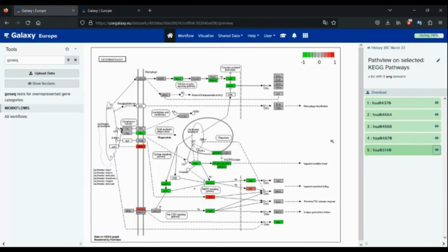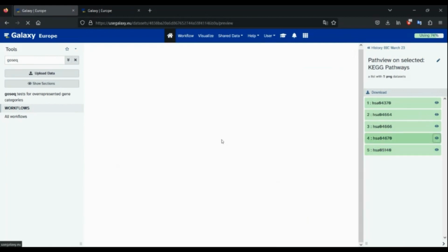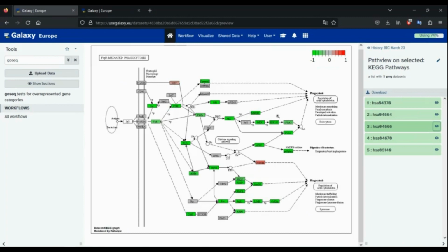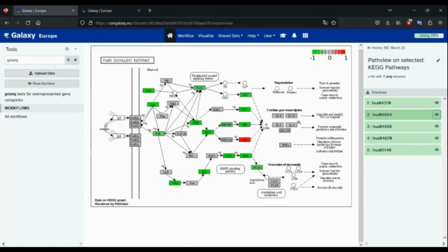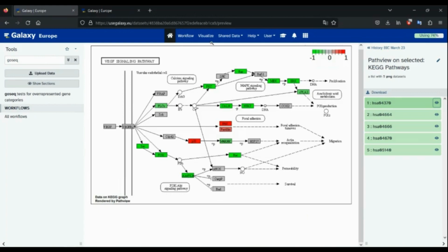And if you open one of them, look, this is what you'll see. So the information we have here is it'll give you which genes that are currently in your list of expressed genes are present in this pathway, leishmaniasis, one of the diseases, and whether it's overexpressed or underexpressed. So this is a good way to start your analysis because generally when we perform DGE, gene ontology is the one that usually follows immediately, and we often have to look at pathways as well. So you get this kind of output, and each one of these was done from within Galaxy.